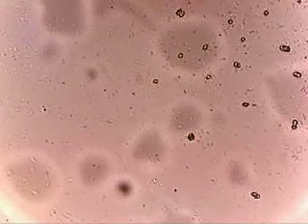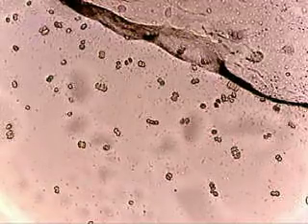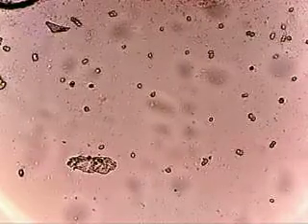Now I'm sure of it. They weren't here before. Notice something else. You see very few of the moving bacteria outside the field of these cyanobacteria, and yet, where there are larger concentrations, you see more of those spirilli.